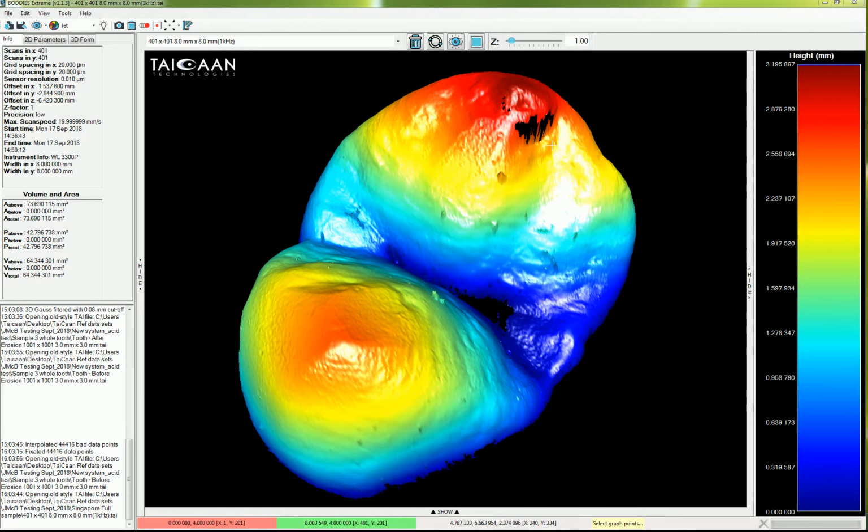We're going to look at calculating roughness values on complex freeform surfaces, and not just the 2D parameters which we've done in previous video presentations. In this example we're going to look at the 3D parameters. So some relatively new advanced work for people who've been following these video presentations. So let's start off by looking at the image.